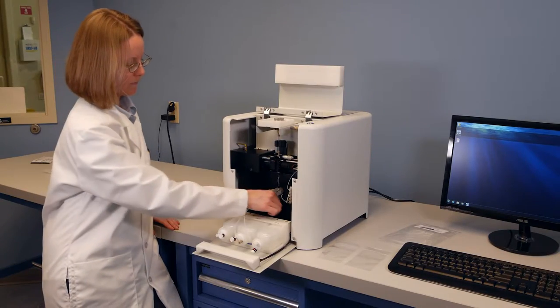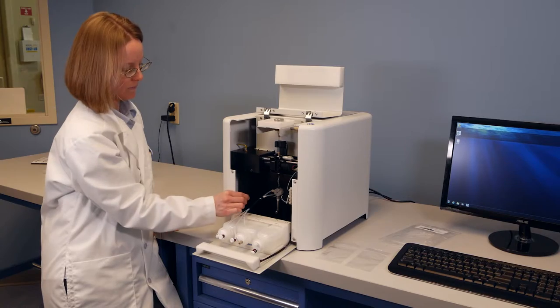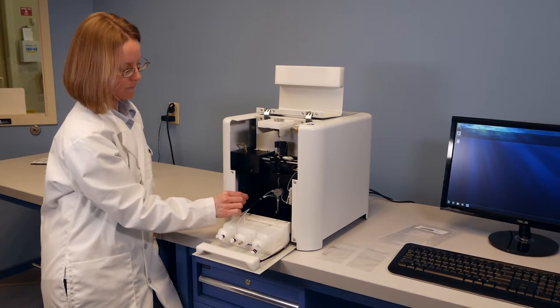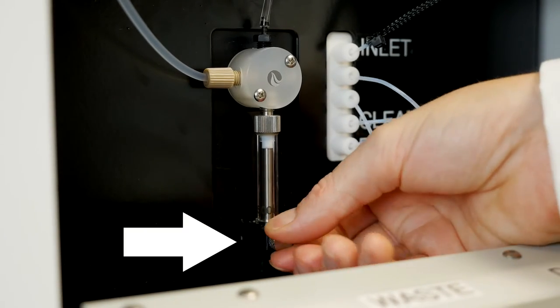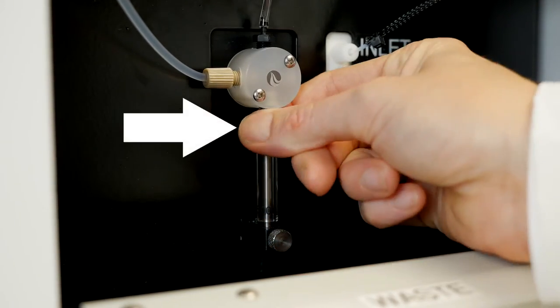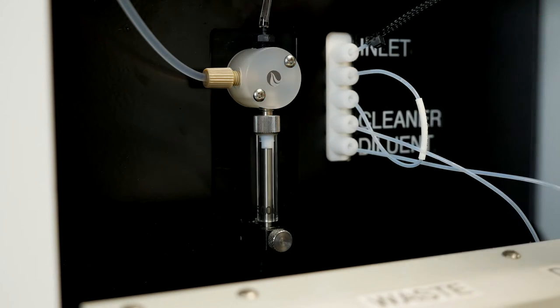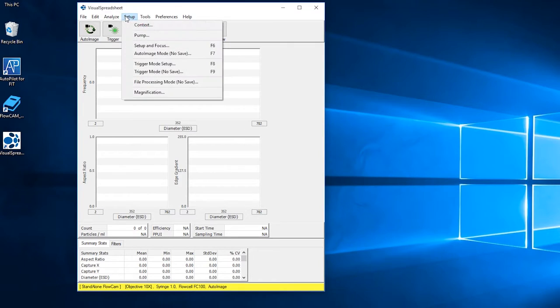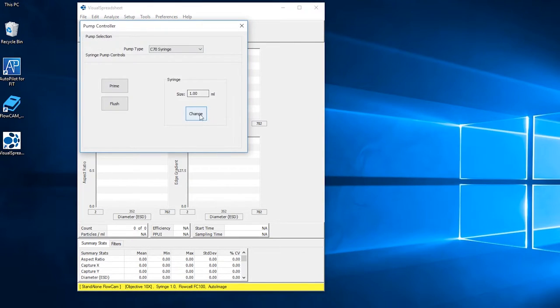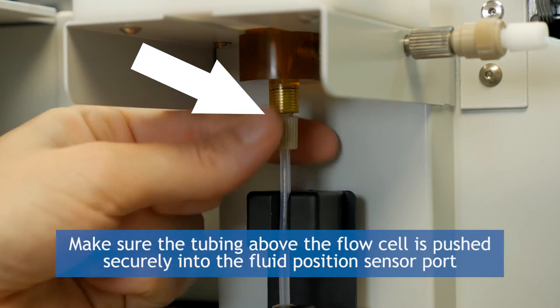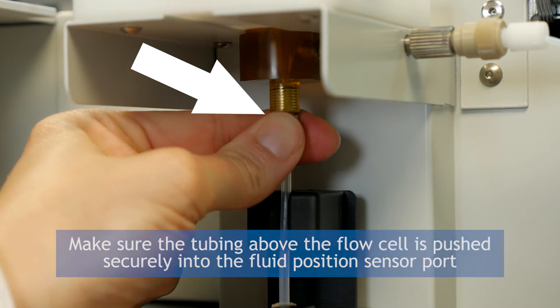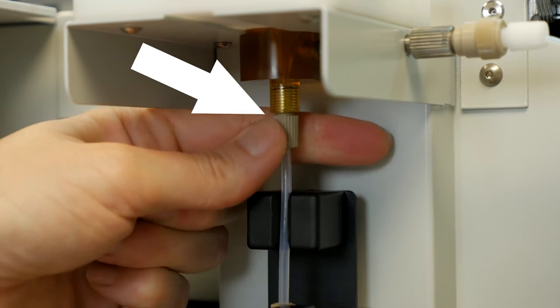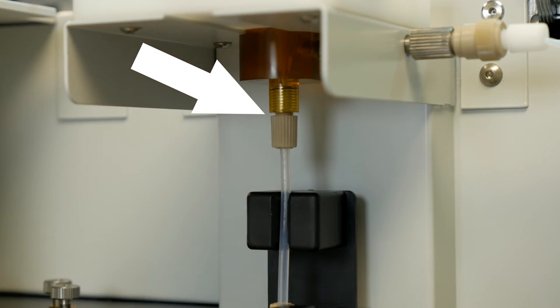You are now ready to do your final hardware checks before focusing the instrument. Ensure that the syringe is tightly secured into the pump. Note that if you need to take out and re-secure the syringe, you can access the change syringe feature under setup pump in Visual Spreadsheet. Make sure the tubing above the flow cell is pushed securely into the fluid position sensor port so that the starting and ending sample meniscus is read properly during analysis.